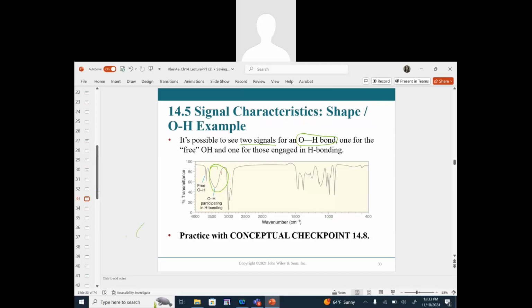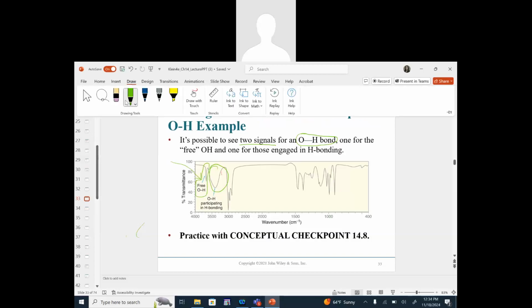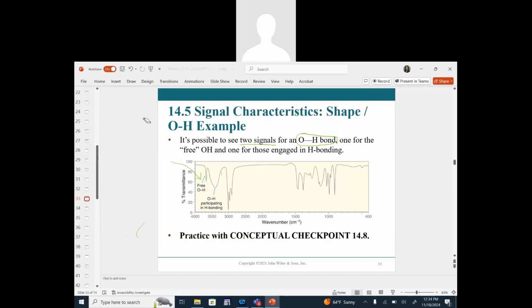And then in our dilute sample, if we dilute with a solvent that is incapable of hydrogen bonding, we can produce what we refer to as free OH, that produce this signal shown here. So again, you should note not only what the signals look like, but also when they appear. The normal presentation, versus the dilute alcohol that produces that free OH signal.